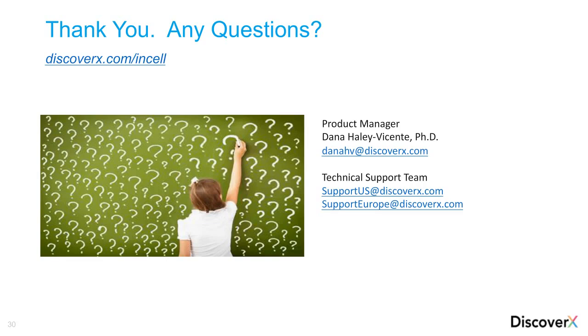Can InCELL Pulse be used in higher throughput formats like 384-well? Yes. So that GSK poster was a nice example where they took the Pulse technology and they were able to adapt our 96-well protocol to the 384-well format. So yeah, this is definitely applicable, and it was like 3 slides back.